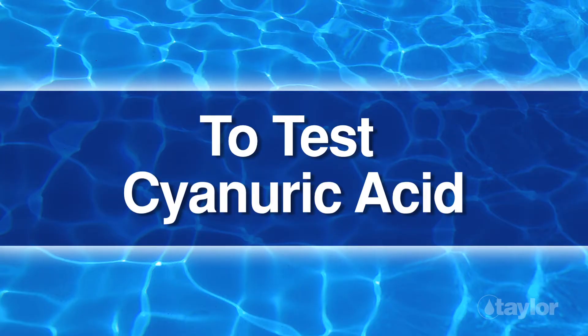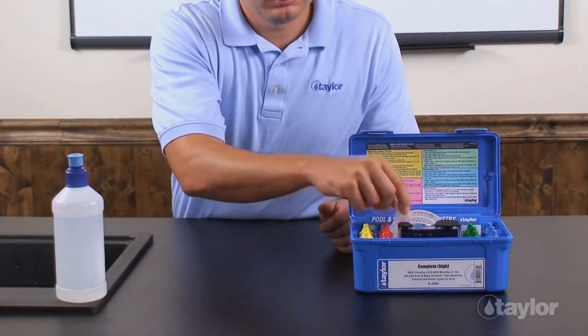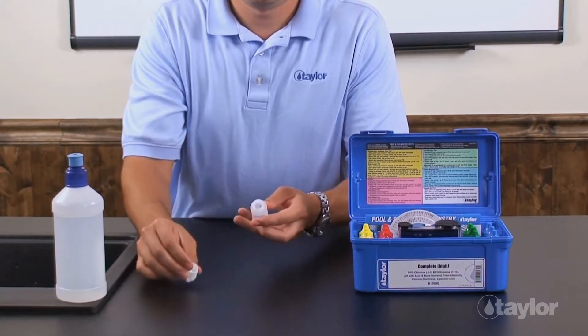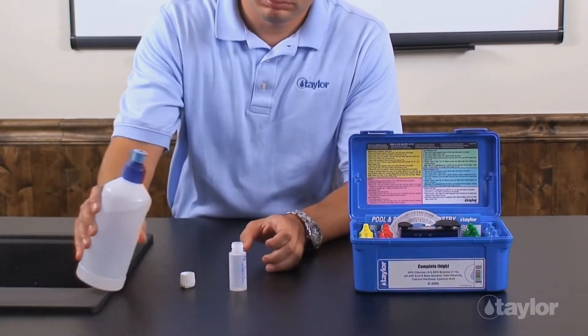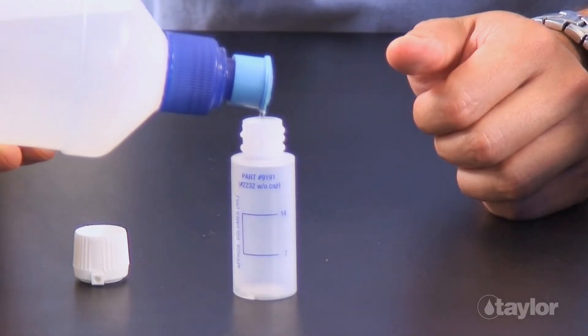To test cyanuric acid, rinse and fill the CYA Dispensing Bottle, number 9191, to the 7 ml mark with the water to be tested.